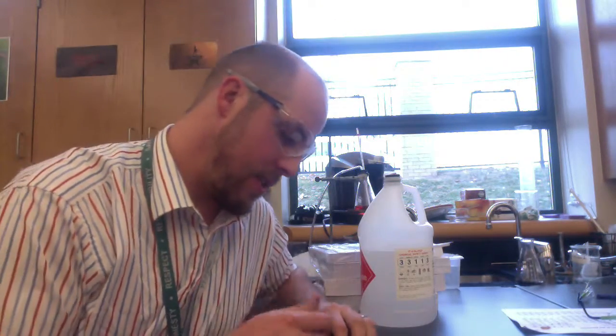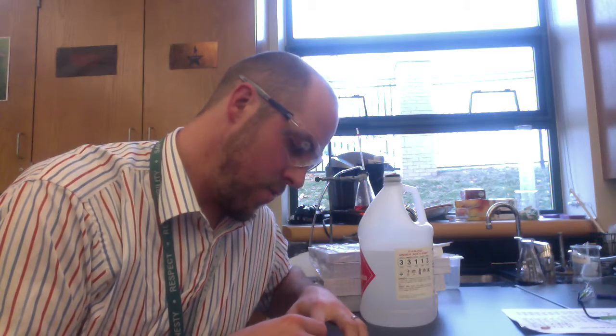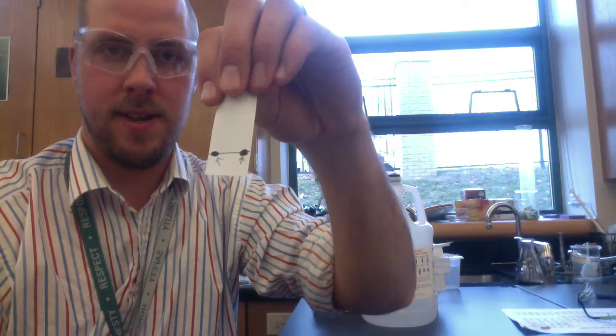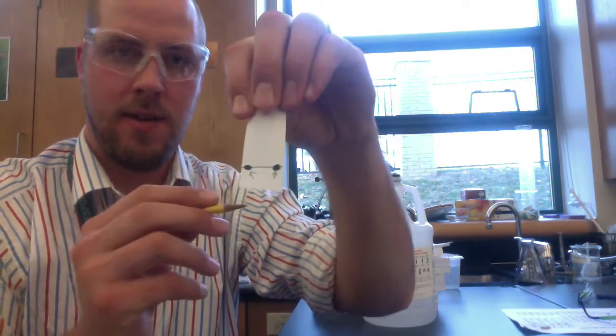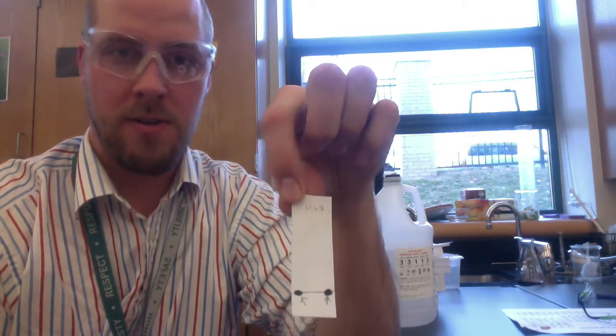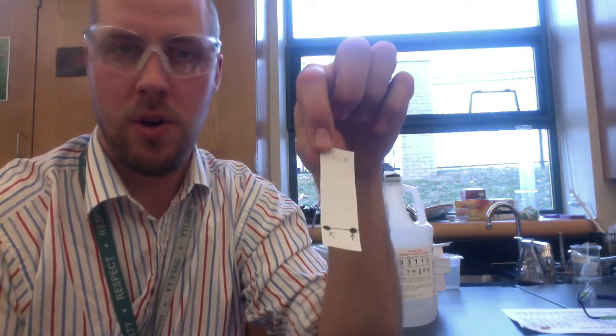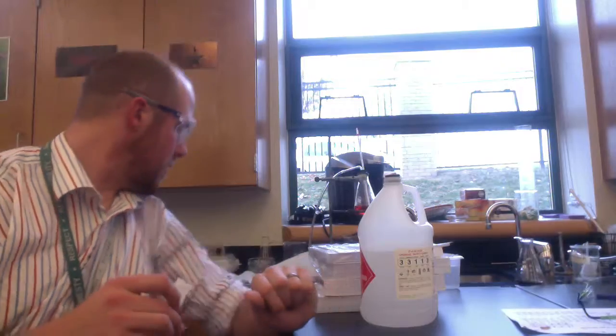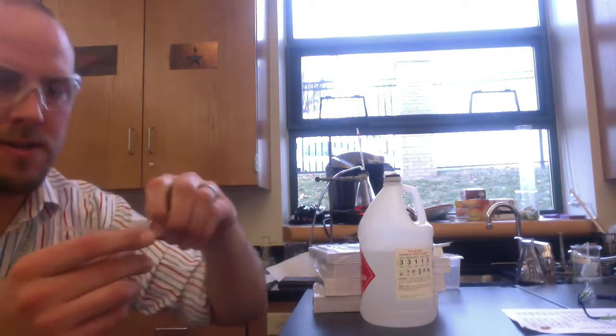And it's a really good idea to label which one is which. I'm not going to take the time to do that, but as you can see, I would label that this is dry erase and that's washable, and then also label your solvent. Solvent is the liquid that you're dissolving something in. Once again, that's on the Google slides. So we've got water as our solvent, and we've got a stir rod here.